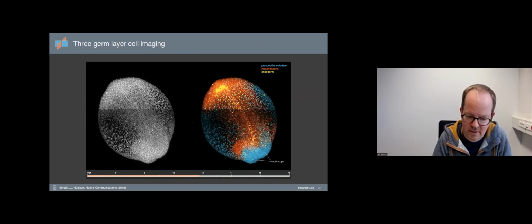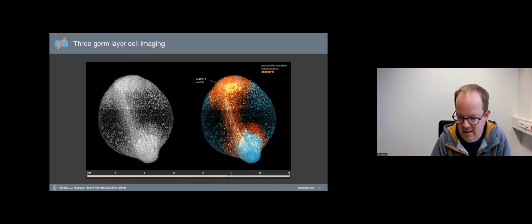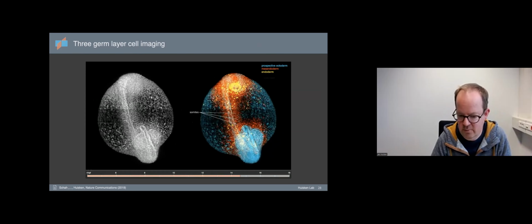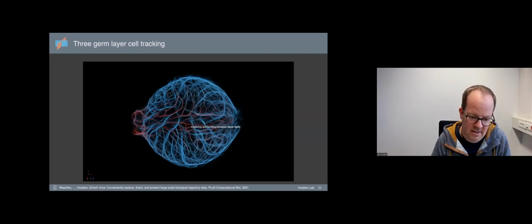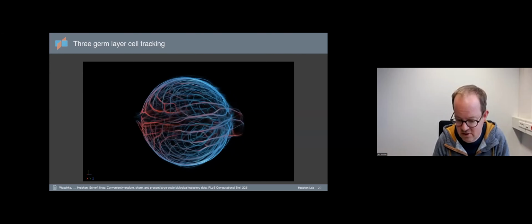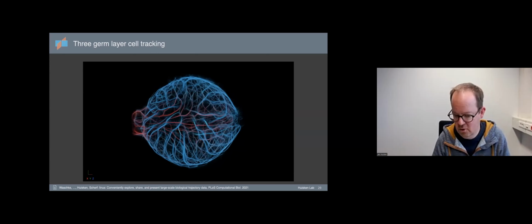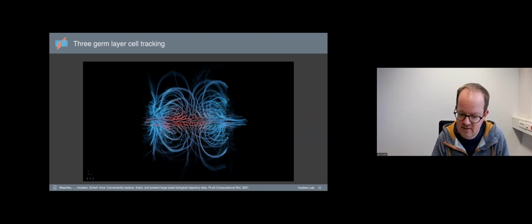because the data is never going to be perfectly high resolution, and the tracking is never going to be perfectly accurate. And so what you end up with is a big data set of all sorts of quality of tracks. Some will be shorter, some will be longer. And so one way of visualizing this data was this idea to cluster the tracks, these tracklets, and that way get a more complete picture of where the cells are actually moving, right? And so again, it's a way to compress the data and visualize it at the same time, with the ultimate goal to do more throughput imaging, right?